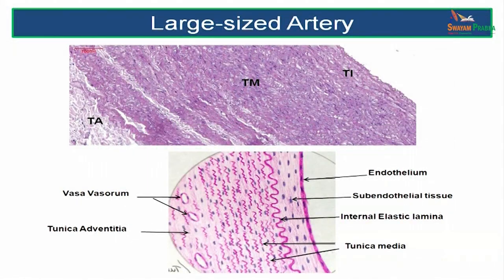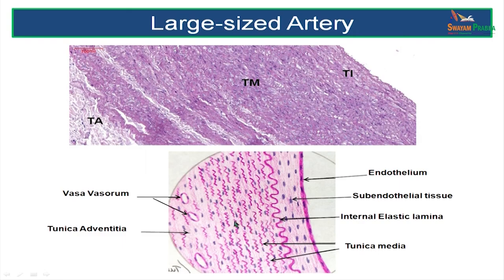In a high-power view of the large-sized artery, you can see the endothelium, the tunica intima, and a very thick tunica media. The tunica media has more elastic fibers and less smooth muscle fibers, so you do not notice a very prominent internal elastic lamina. In the diagram, you can see the endothelium on a basal lamina, subendothelial connective tissue, a less prominent internal elastic lamina, a lot of elastic fibers in the tunica media along with smooth muscle cells, and a much thinner tunica adventitia. Note the vasa vasorum in the tunica adventitia.